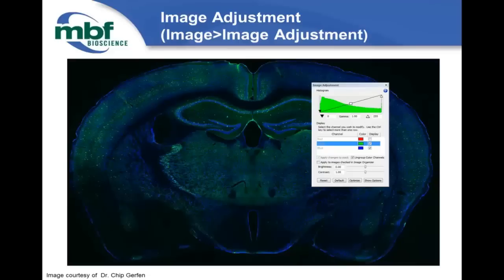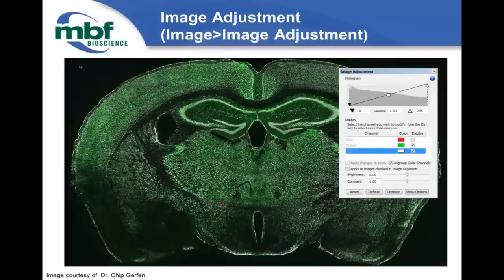What if you're making an image and blue has terrible contrast with black? You can click on the color swatch, which brings up a color palette so you can choose a new color. For instance, you can make blue white — and there's much more contrast. You can go through and change the colors to make what you're trying to visualize pop.